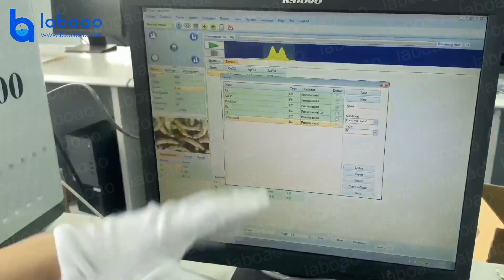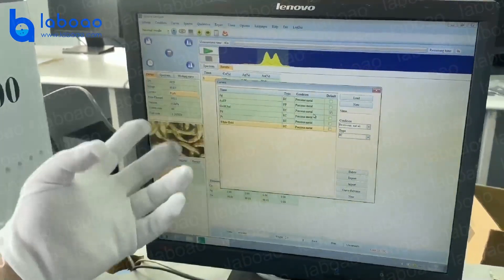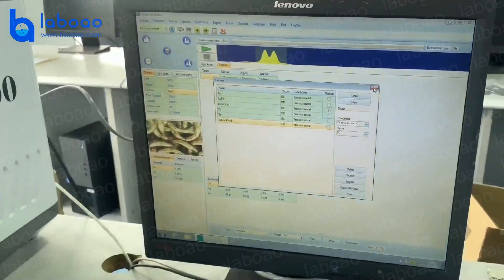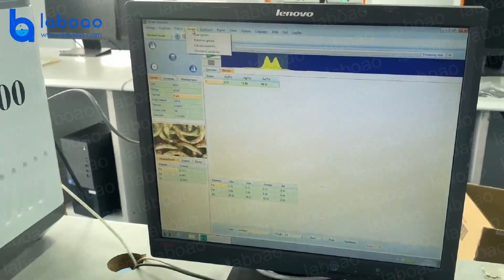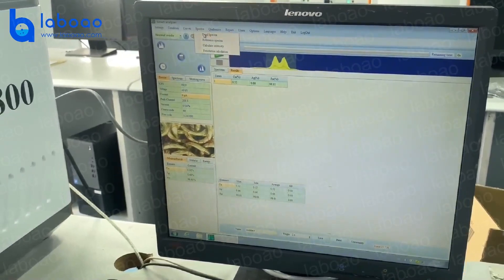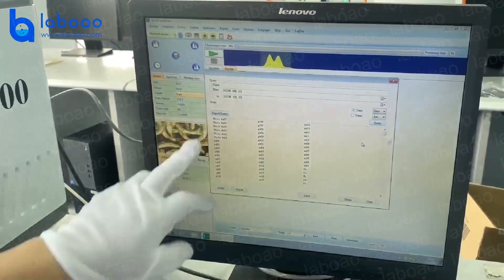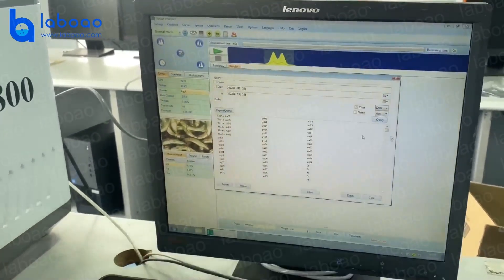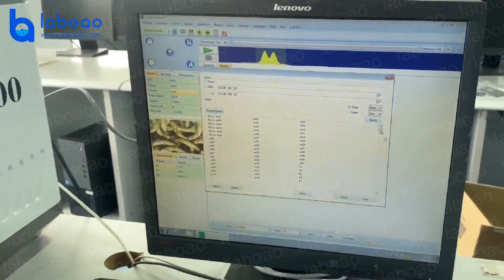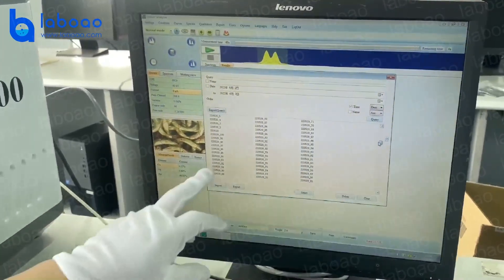It's all prepared before delivery of the machine to customers. This shows the standards we scanned — it's all like a database of spectra.